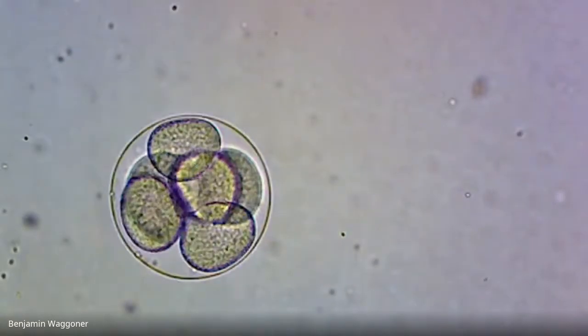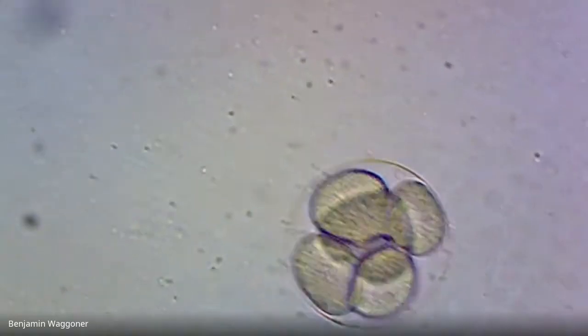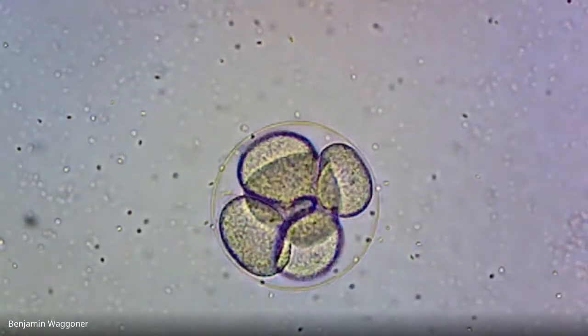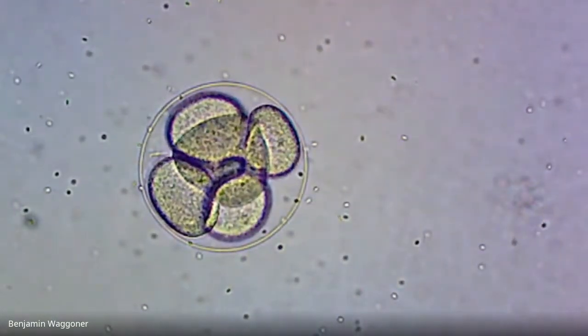That one may have, this one up here, 1, 2, 3, 4. I count 6. And again, that's kind of odd. And this is another one that I think got fertilized too many times and is having to cope with exactly the wrong number of chromosomes to divide properly. So yeah, some of these are, yeah, this one right here is another that looks like a 5-cell. Yeah, I can see 4 on top and then there's 1 underneath. So again, that's what you get if you bomb the eggs with too much sperm. You get abnormal development.